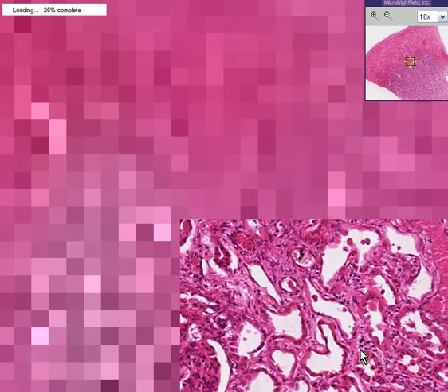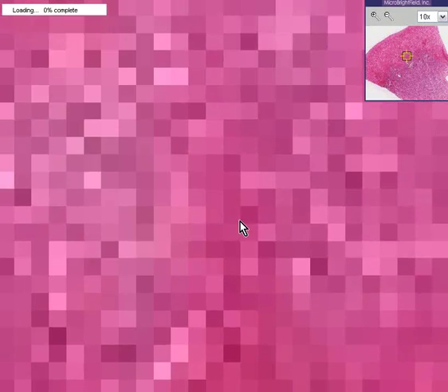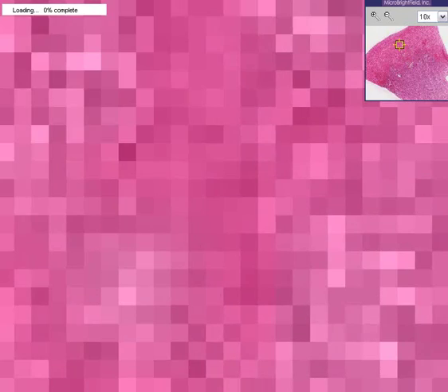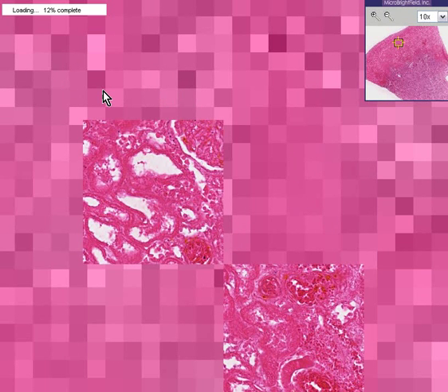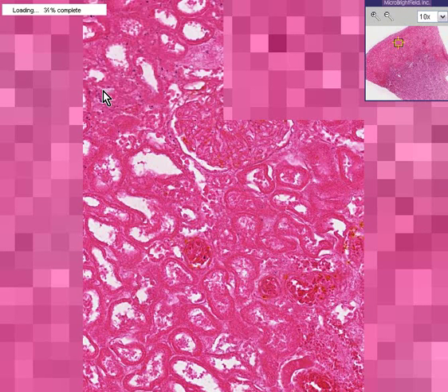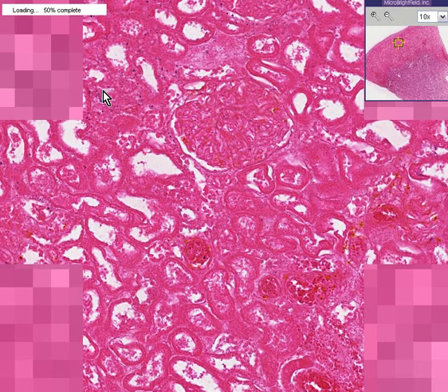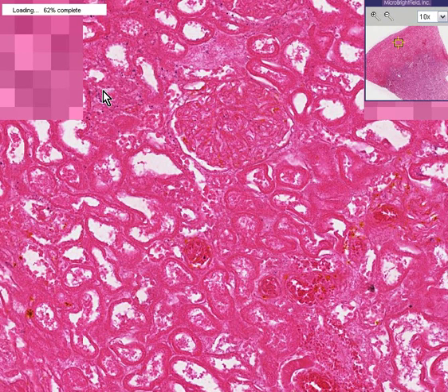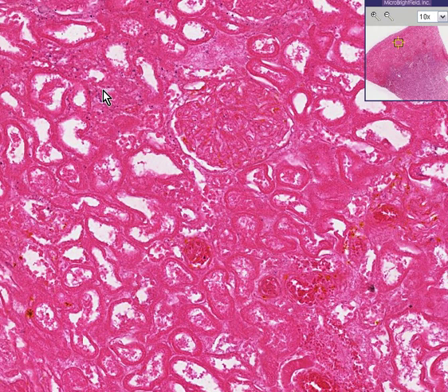But as we move our pointer out towards the peripheral zone here, I think you will agree that this is entirely 100% coagulative necrosis, and you really can't make out outlines of any cells at all. Thank you very much.